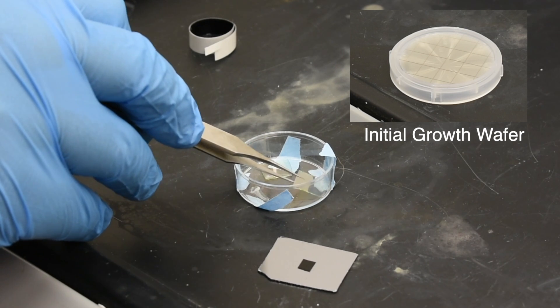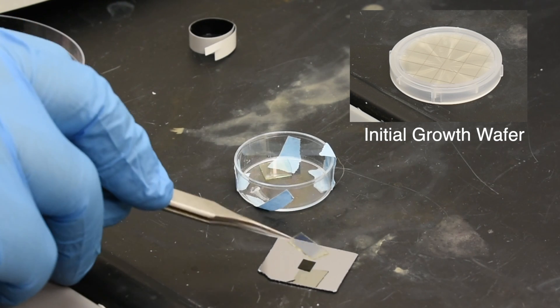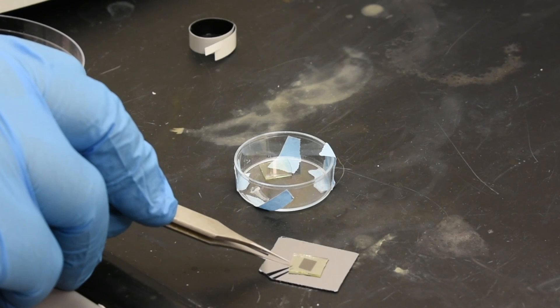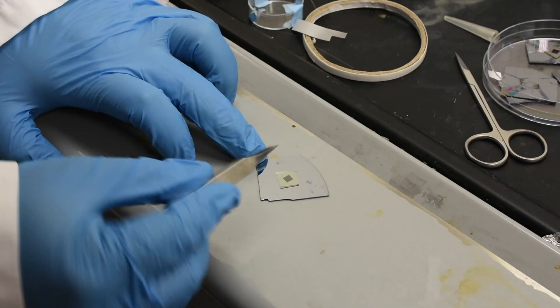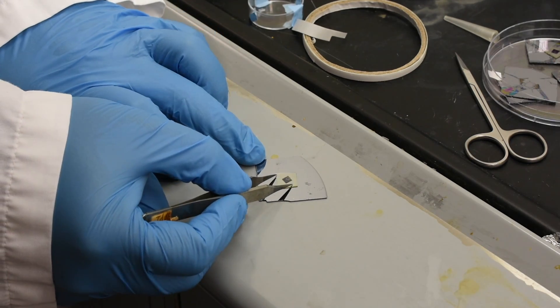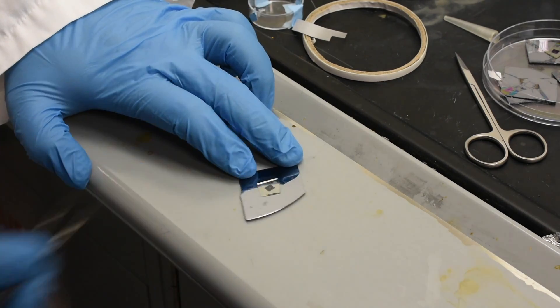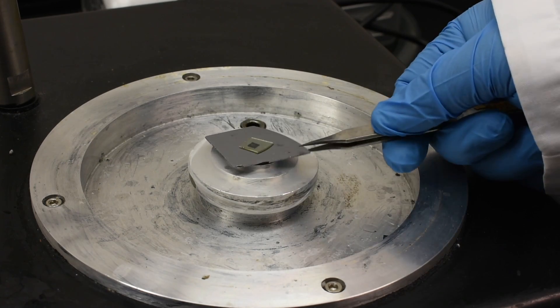Here, a piece from our initial growth substrate, molybdenum sulfide on sapphire, is being placed onto a piece of silicon wafer with a small piece of double-sided tape attached. After pressing our initial growth wafer piece firmly to the silicon wafer, the sample is moved to the spin coater.